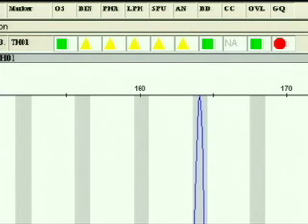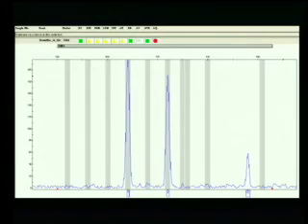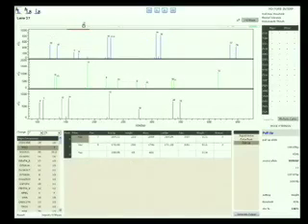The analyst can toggle to the raw data to confirm that this peak is due to spectral pull-up. Additionally, if you remember the pink indicator of off-scale data, we have the peak indicator turned off here. That would have been very helpful in identifying that this sample was actually spectral pull-up.